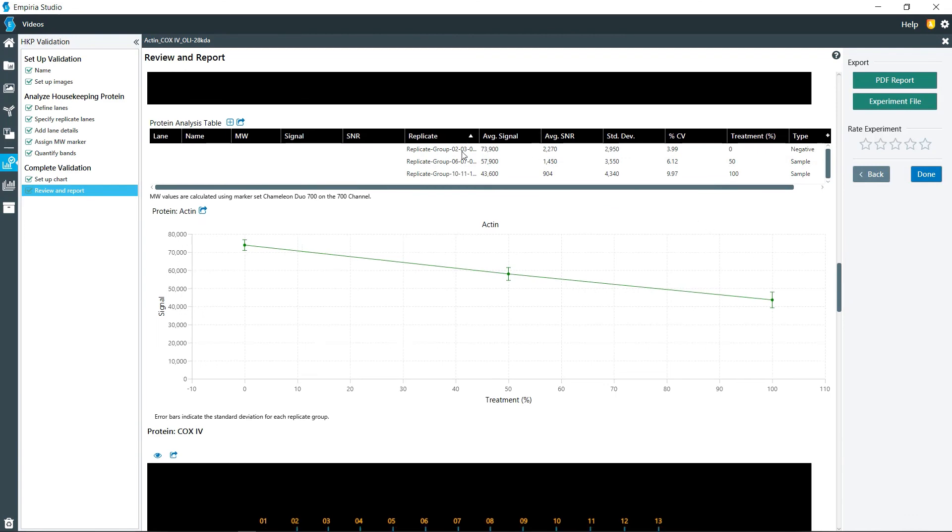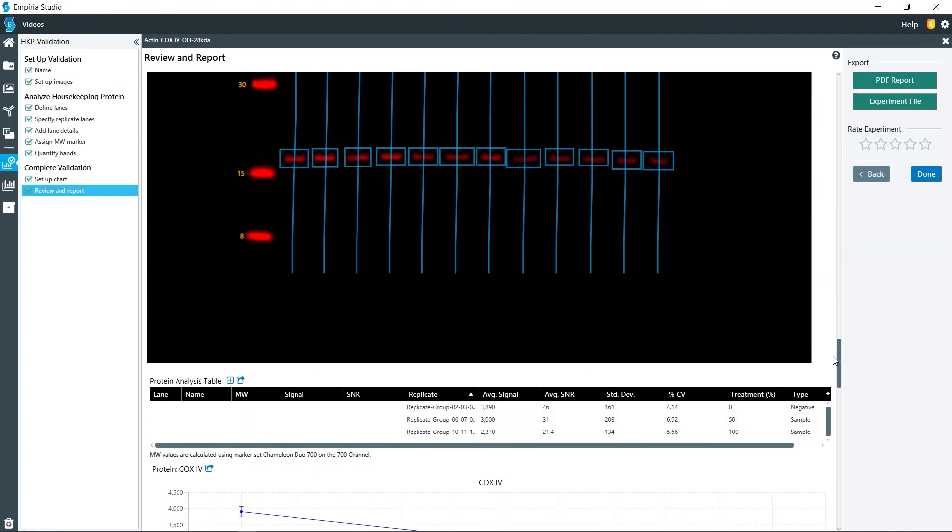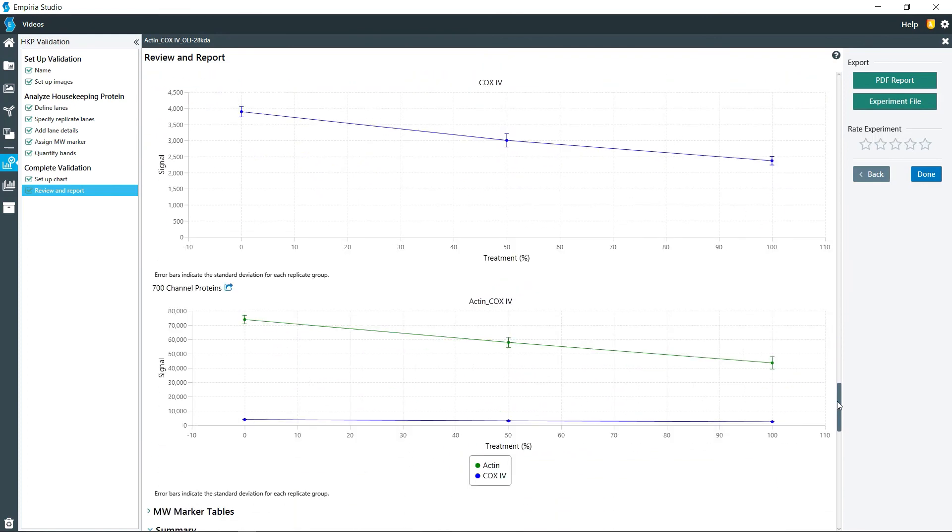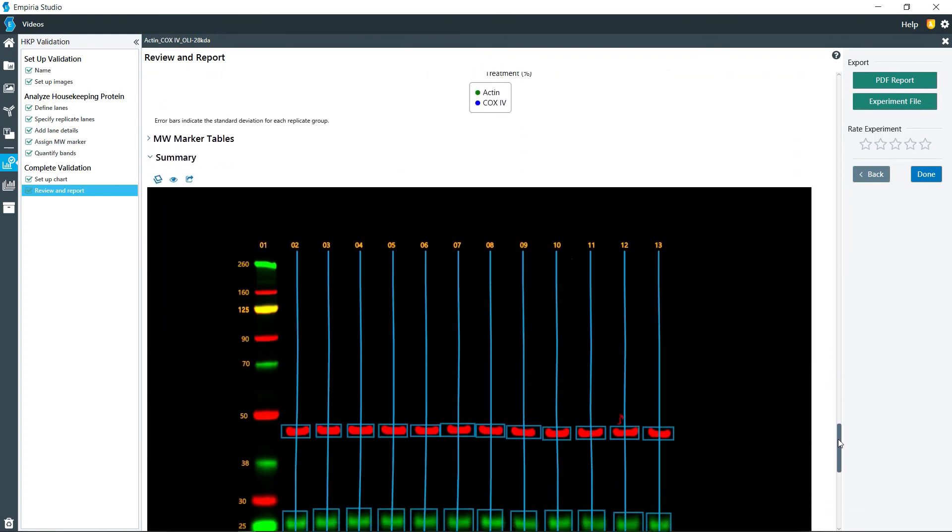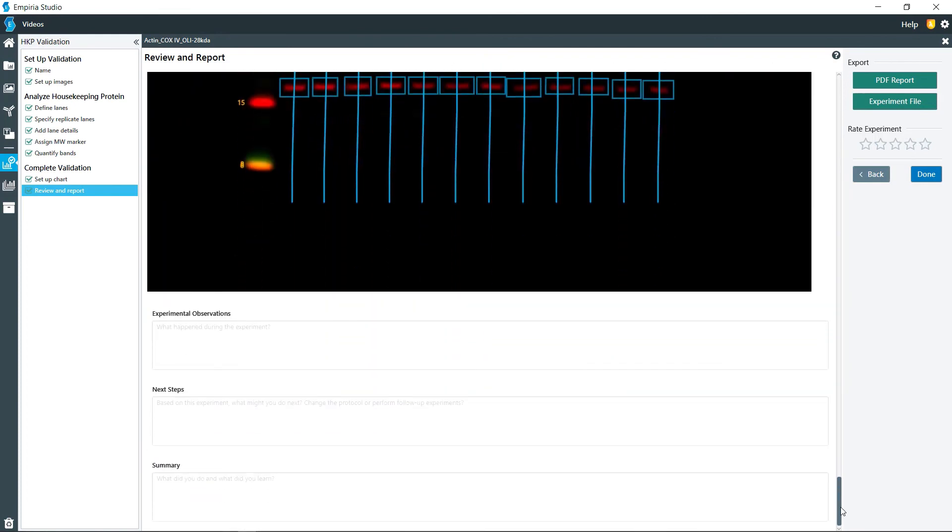And again, it gives you the replicate group. And then for the COX-4, it gives you the graphs and then the composite image at the end.